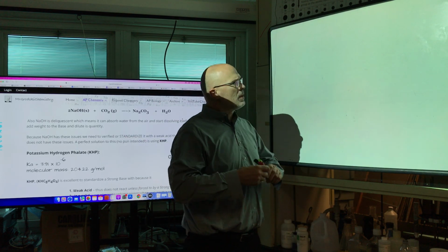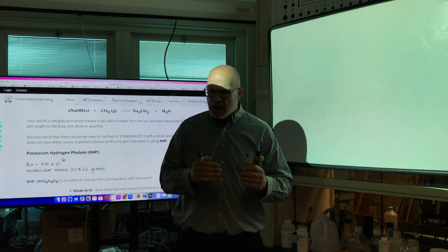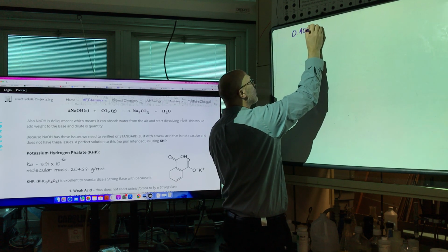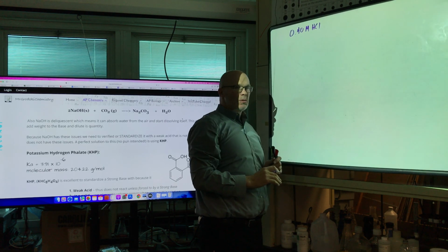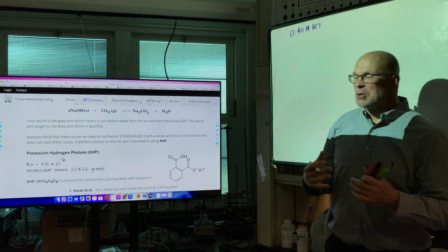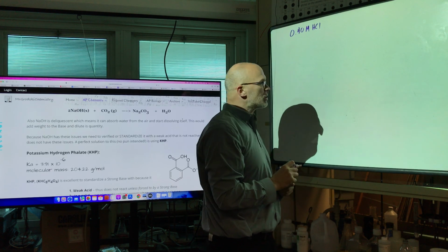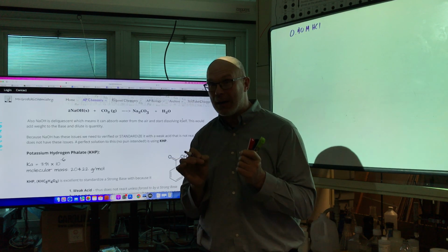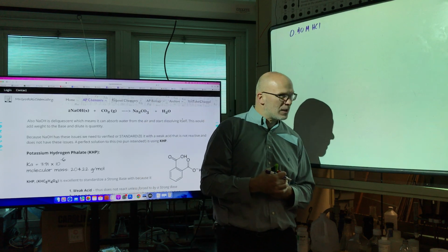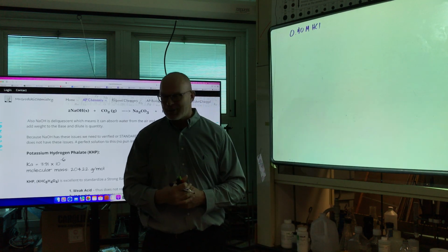All right, so from yesterday, we decided, based upon what we want to titrate and the target amount of calcium carbonate that is in the Tums tablet, that we wanted to make 0.40 molar hydrochloric acid. Okay, we're going to add 100 milliliters of that to our 2 tabs. And what we're going to do with that is overshoot the equivalence point so that we can drive the reaction by Le Chatelier's principle and find every little piece of calcium carbonate hiding in the tablet. Remember, we've got sucrose, food coloring, flavoring. No one just eats chalk, except for the kids outside playing harmlessly, who you think, when you turn around, are taking hits of calcium carbonate. All right, that's crazy. The calcium they might need.